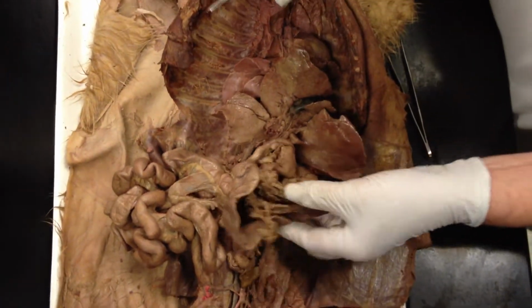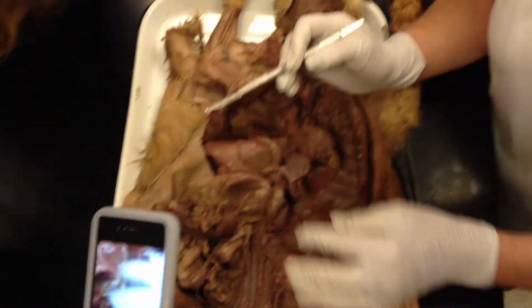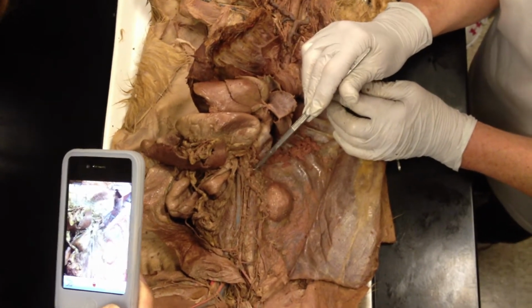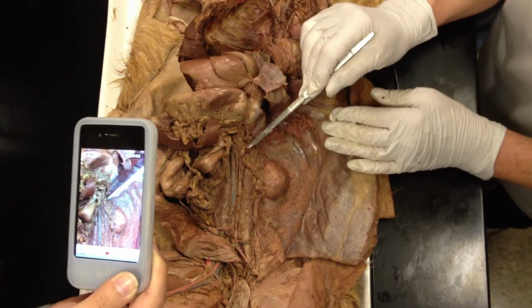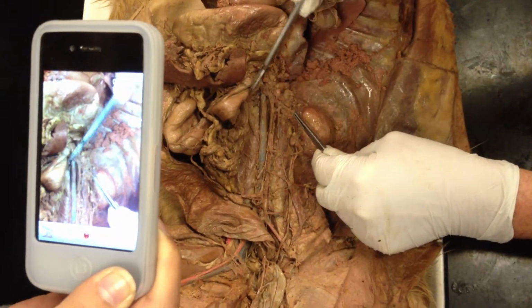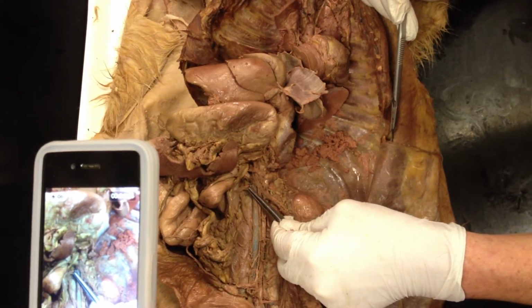Okay, so let's shift everything over to the right so we can continue to see some of the other structures. Now, your inferior vena cava is going to be here. It's going to feed the adrenal gland by way of the adrenal lumbar. The adrenal lumbar vein runs right over the surface of the adrenal gland, and then directly below that, you're going to have the renal vein. The other renal vein on the other side is probably a little bit better. You can somewhat see it over here. Okay, it's a little blue, not significantly so.